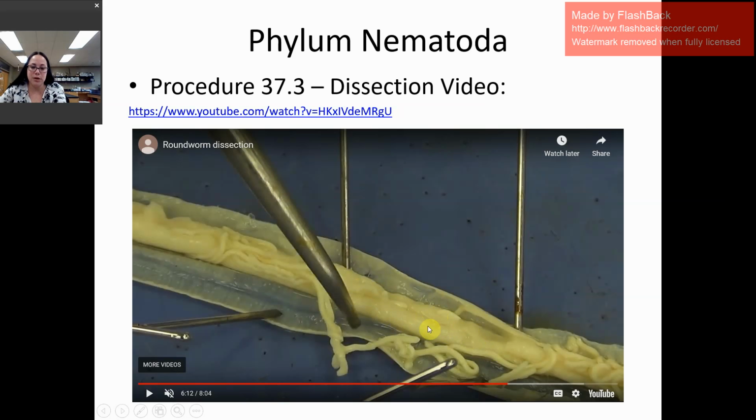There's one here that you see a little bit, and one on the back over here. Those uterus tubes are going to become smaller and less wide, and this is what we see over here. And those smaller noodles are the oviduct.